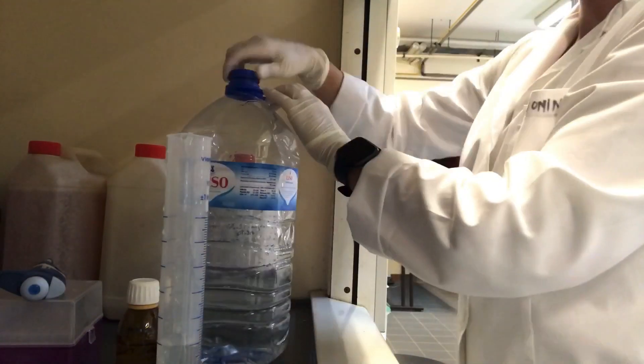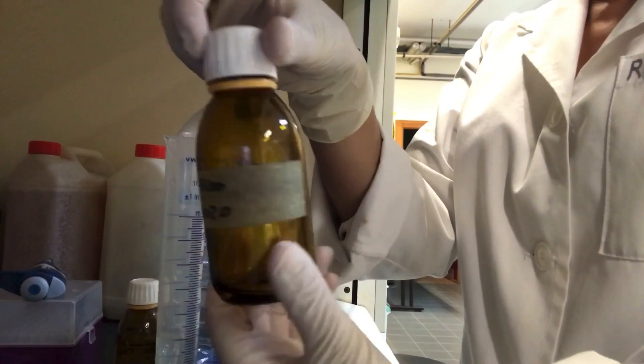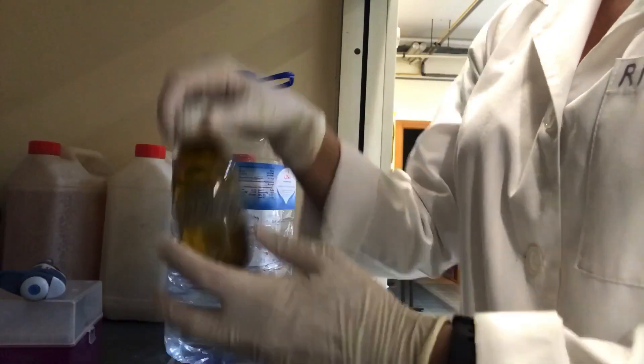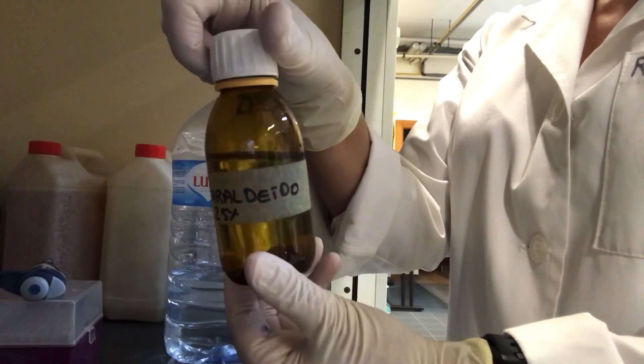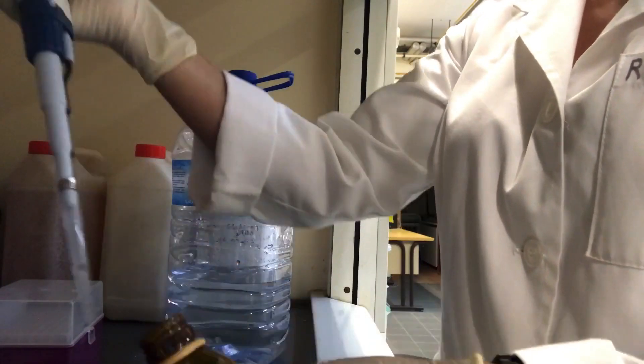For a final concentration of glutaraldehyde of 0.2%, add 400 microliters of glutaraldehyde to fix the sample and homogenize gently. Then store the sample in the fridge for a maximum of 24 hours.